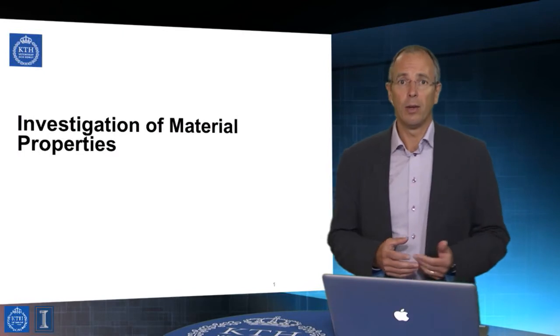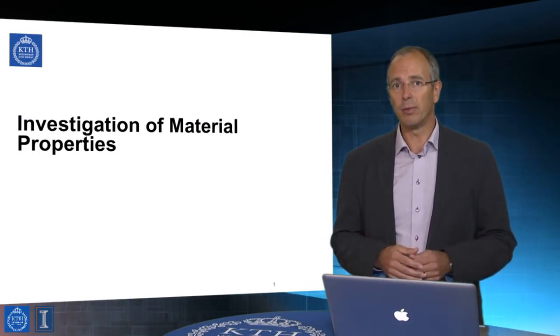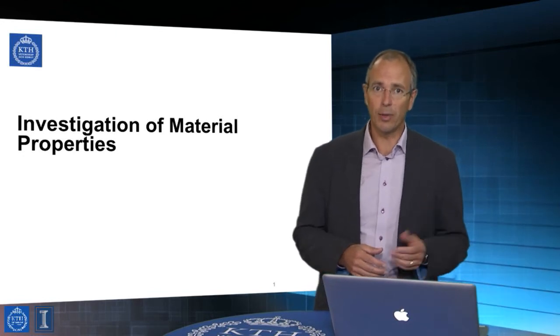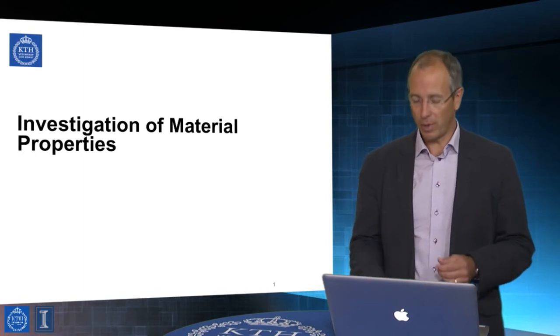Welcome back. In the last video, what we studied was how we can use AFM to get a topographic picture of a surface. So 3 dimensions, structure, but no chemical or materials property type information. That is something we may very well want to understand, what's on the surface. And what's on the surface can be revealed both by material and certain chemical fingerprints that we're going to examine during this lecture. So the focus is now more extracting material types of properties.